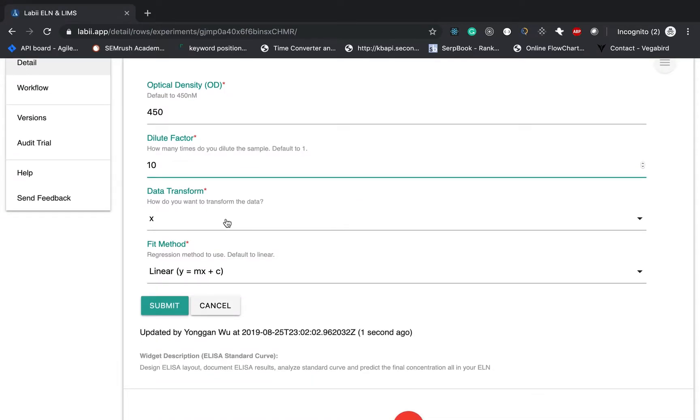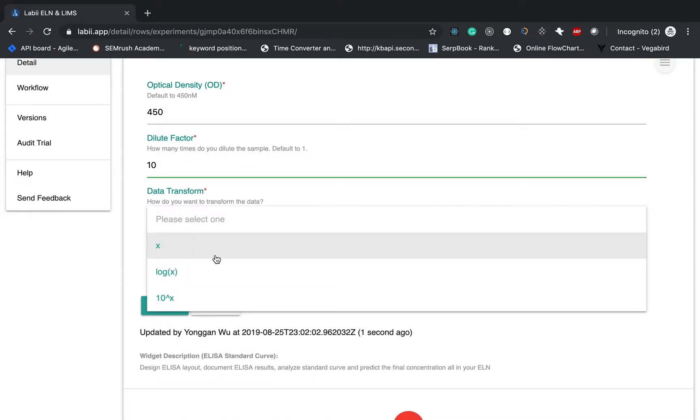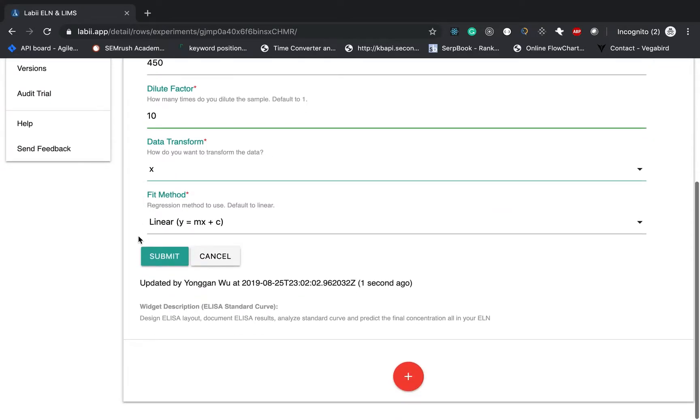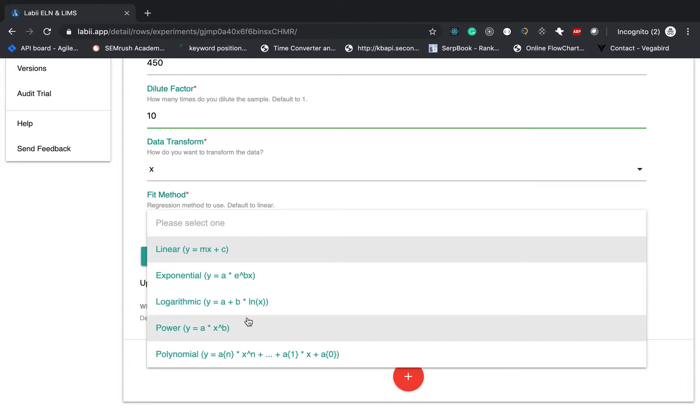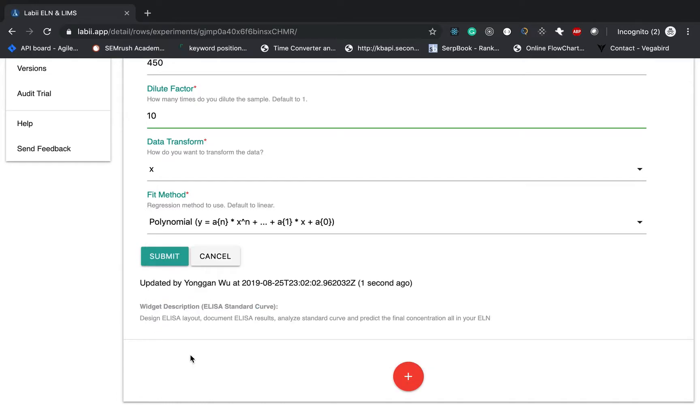You can also transform data. For example, using the log X to transform all the data into log. And then for the fitting method, there are many different fitting methods to use. This is linear, log, power. So over here, I'm going to choose the polynomial. And then click submit.